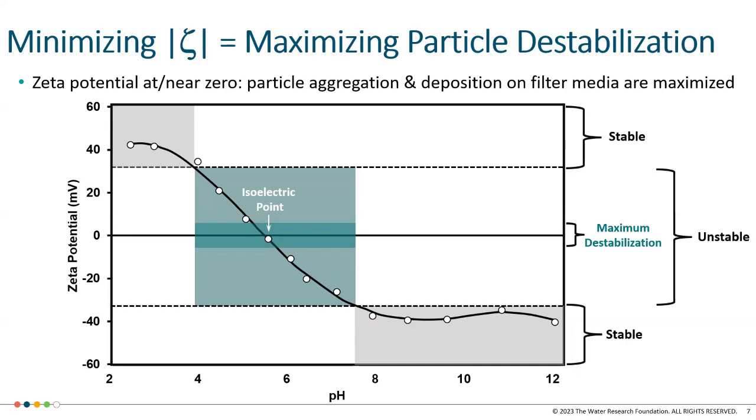In our project, we've shown that high quality source water requires coagulant addition to the point of maximal or optimal particle destabilization so that we can achieve the 3-log Cryptosporidium removal expectations that we have for rapid filtration. And we've seen that we have to be in this tight band around the point of zero charge. And again, this will be discussed more in module 6 of this series.